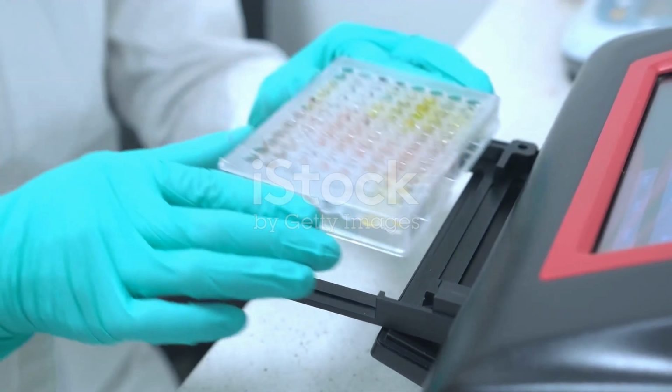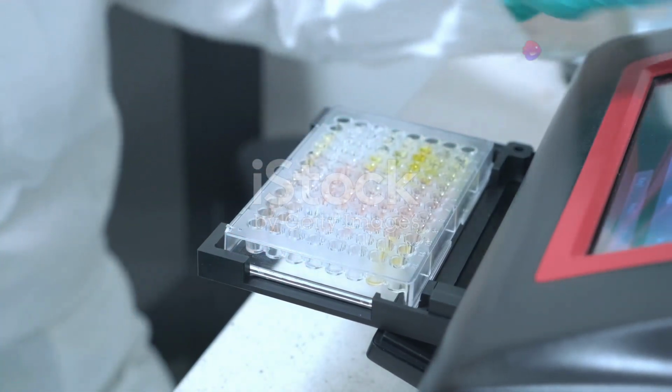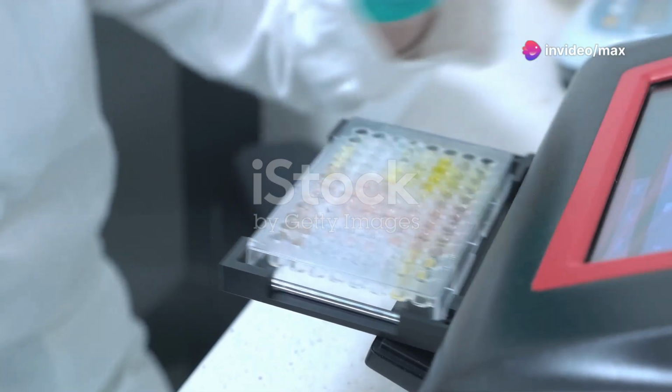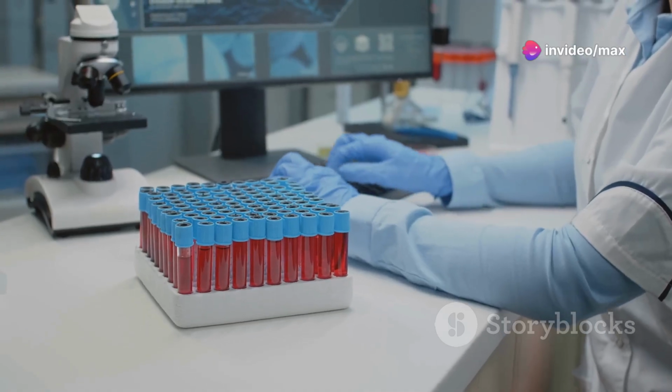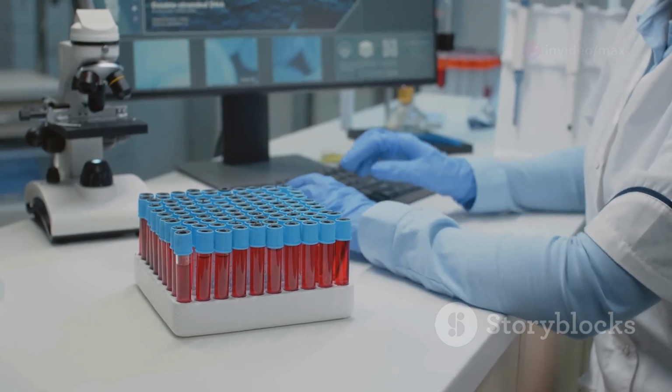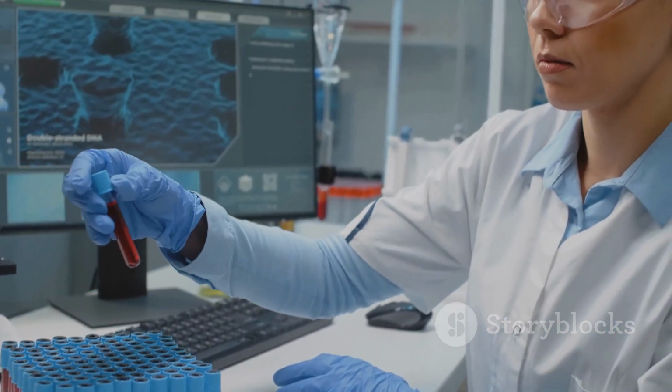Second, sandwich ELISA is highly sensitive, enabling the detection of even minute quantities of antigen in a sample. Third, sandwich ELISAs can be easily adapted for various sample types and target antigens.